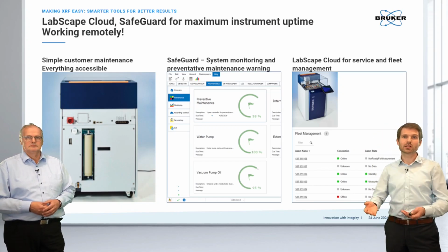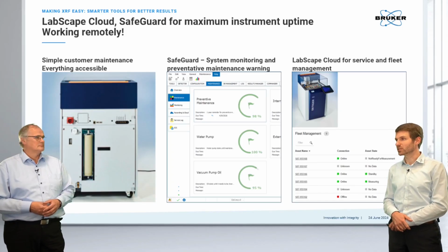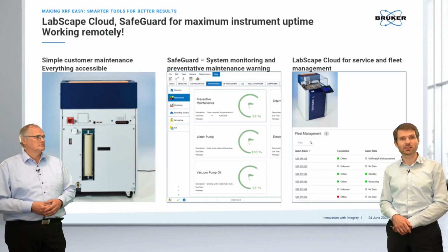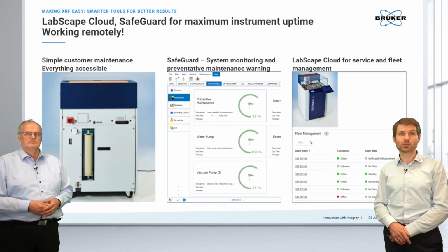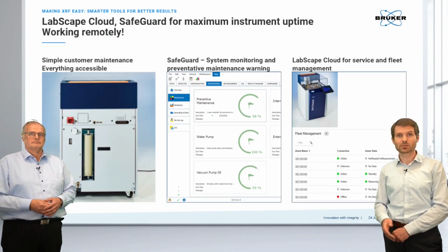And this is all even supported by augmented reality tools where our service engineers can really guide you to make smaller changes or adjustments if needed. So this helps us to do actual predictive maintenance if needed and improve and boost your system uptime and availability, saving you time and money.